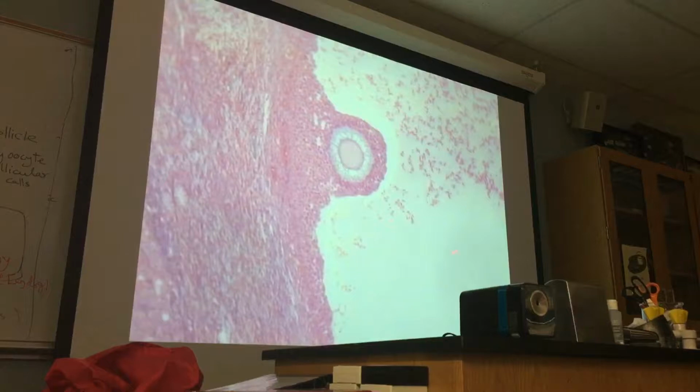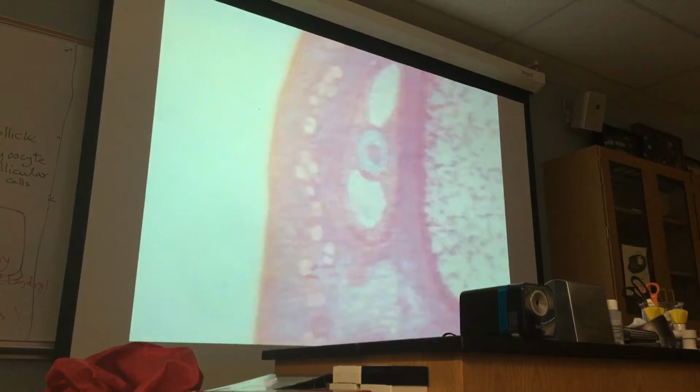And of course, this will look much better. This region, this is the gamete, female gamete. If you recognize this as Graafian follicle, then this must be secondary oocyte, not primary. Let us go back to primordial follicles.